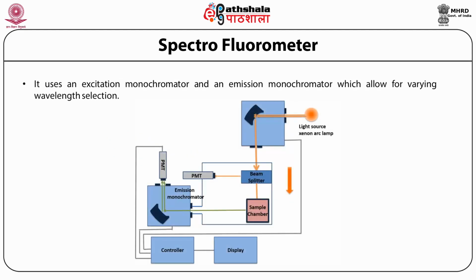In the spectrofluorometer, most spectrofluorometers record both the excitation and emission spectra. The resolution is obtained with changeable fixed slits. The advantage of spectrofluorometers is that they allow for varying wavelength selection. The operator can scan a substance over a range of wavelengths.